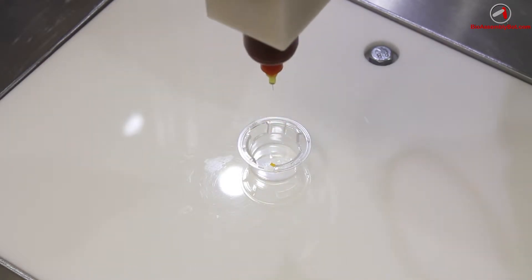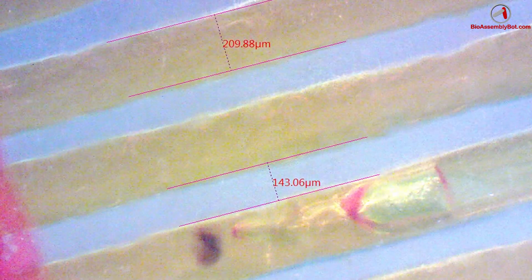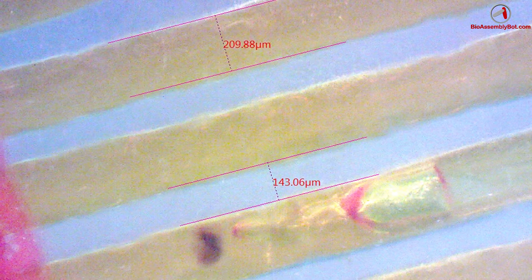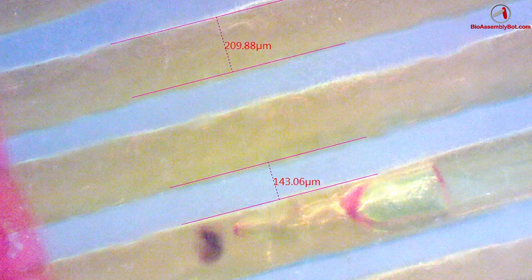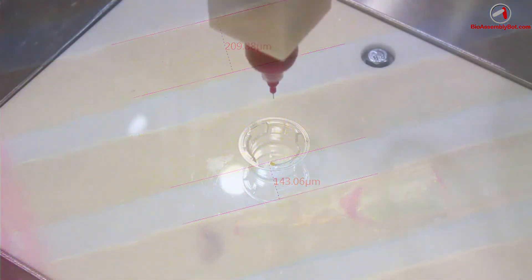In this particular case, the channels are intended to be approximately 210 microns in diameter with an approximate 140 micron spacing.